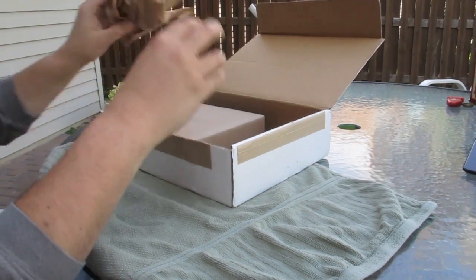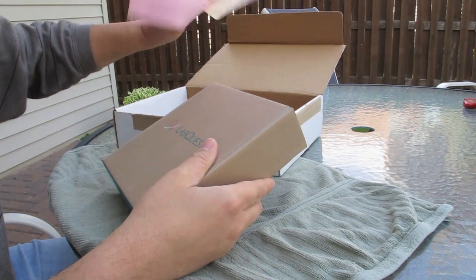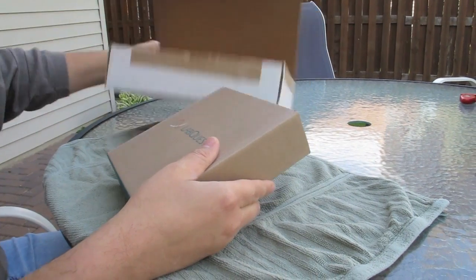It reminds me of that episode in Simpsons where they're at the box factory — extra packaging. I think we got some purchase orders, rebates, mail your warranty, thank you card. We'll throw all that away.